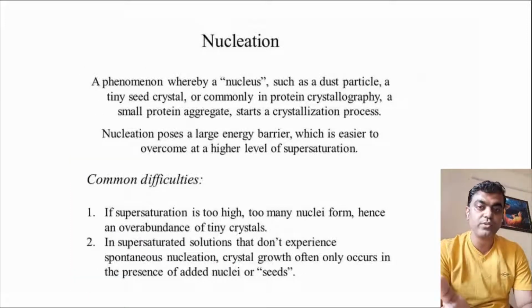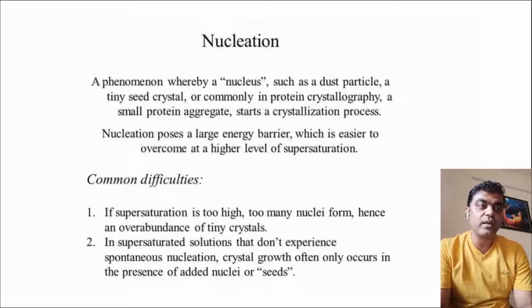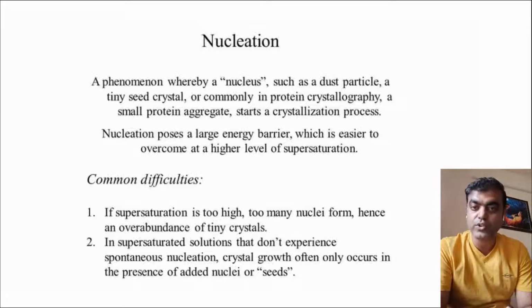Now what is nucleation? I was talking of nucleation. This is a phenomenon where, you can say, a dust-like particle, or basically a nucleus, a very tiny seed crystal, a small protein aggregate, starts the process of crystallization. So to start the entire process of crystallization, first of all, it is a solution, or basically a mixture.